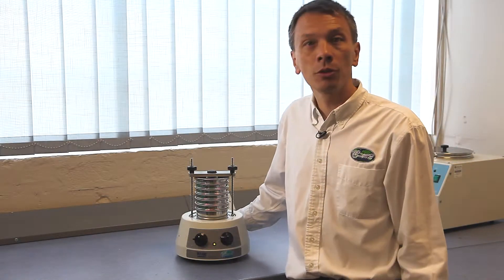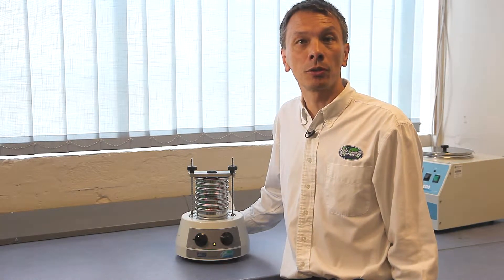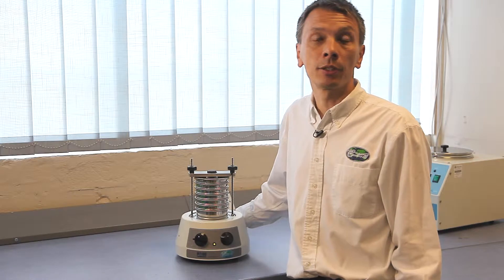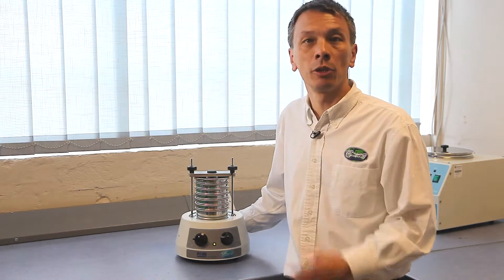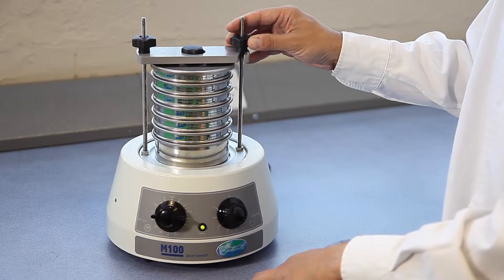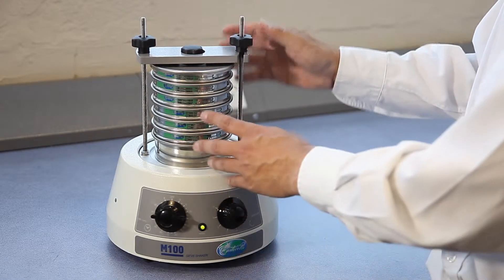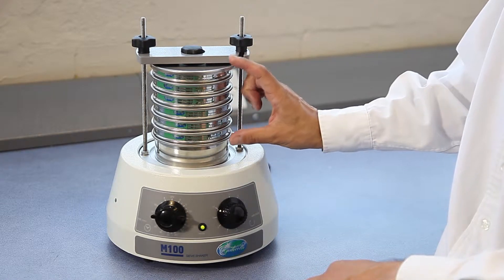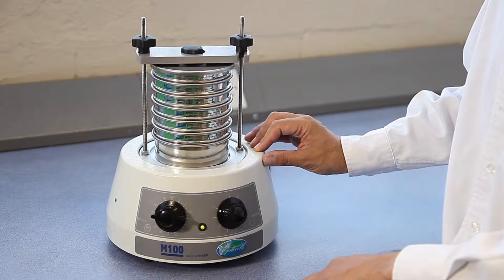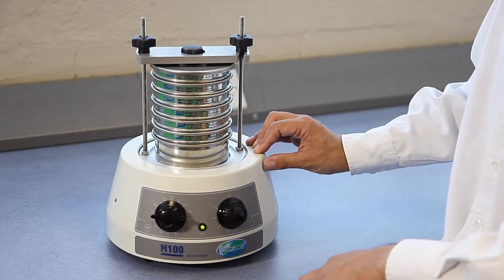The Endicots M100 shares many of the features of the Endicots Miner M200. It's compact, it's light, it's portable, maintenance-free and very quiet. This machine has been specially designed for 100mm and 3-inch sieves. It holds a stack of 6 half-height 100mm sieves or 3 full-height 100mm sieves.